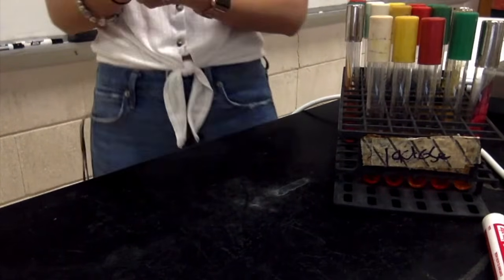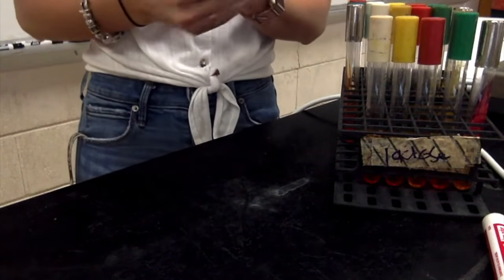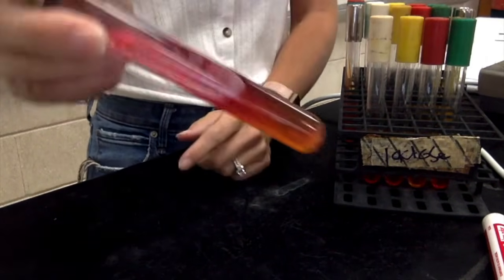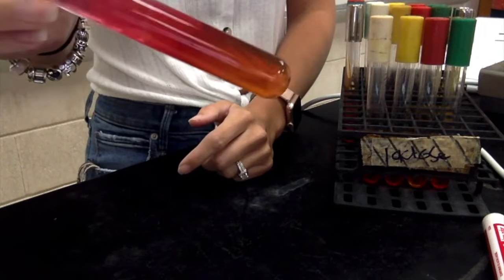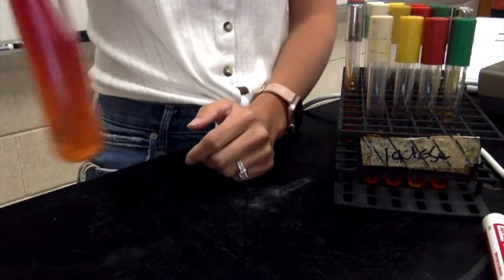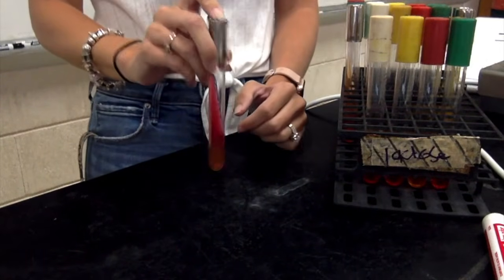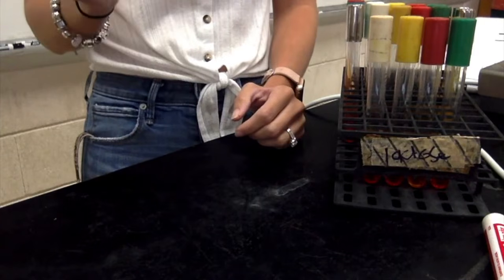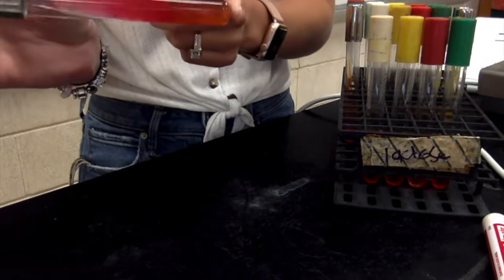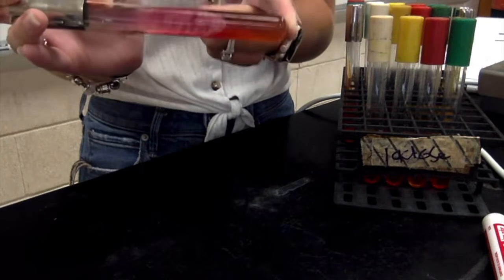Now, the last one that we're going to read is Pseudomonas aeruginosa. So here's our TSI tube, and you will see that it is a red tube. So your result for Pseudomonas would be K over K, an all red tube. No gas produced, of course, because no fermentation occurred, and there is no H2S production, no black. So K over K, no gas, no H2S.